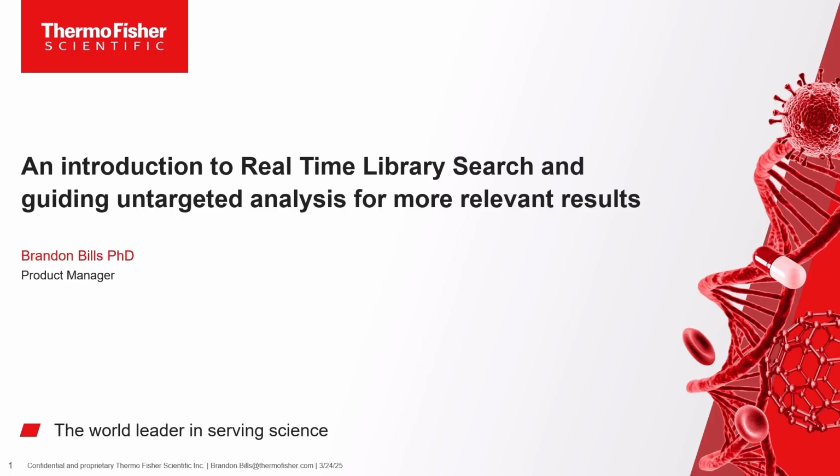Today I'm going to talk about untargeted analysis and how you can use real-time library searching to give an instrument a little bit more guidance so that your final results will have the most relevance possible.